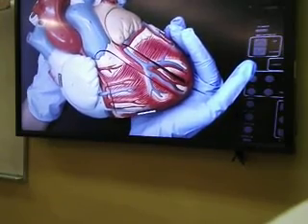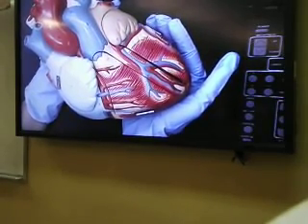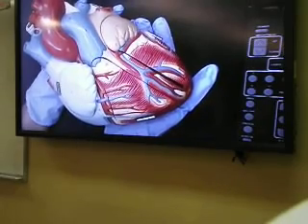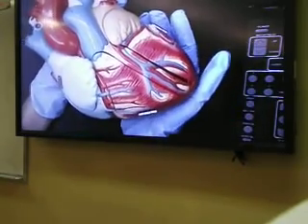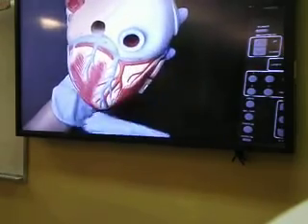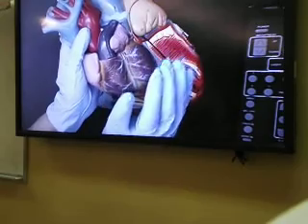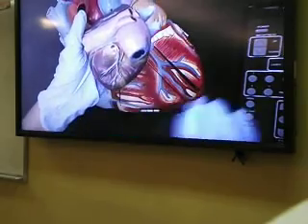Now, the first thing to understand is what makes us say that this is the anterior view of the heart, not the posterior view. The anterior surface of the heart, which we will see in a real heart, such as the sheep heart, which is very similar to ours, is more rounded and has a prominent ridge, compared to the posterior or dorsal surface, which is more flat. The smaller model in the lab shows it a little bit better. So the anterior aspect is a little bit rounder and has a ridge, while the posterior or dorsal aspect is more flat.